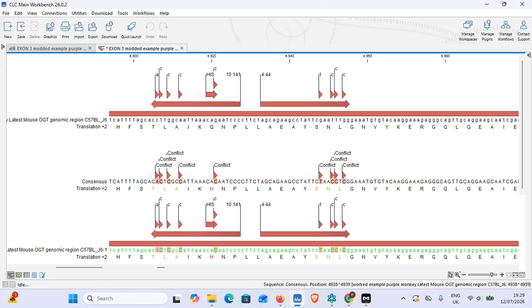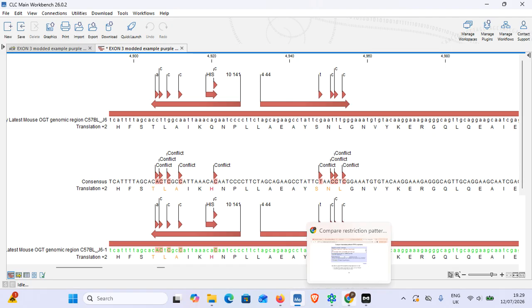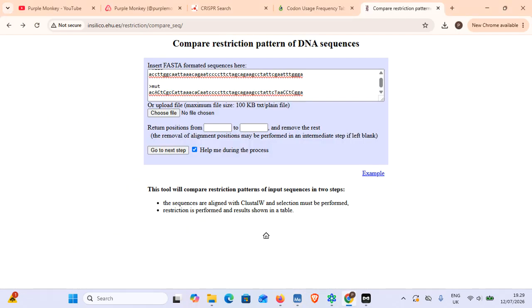But this is only part of the battle, and circling back to my video about flies, my first video, is, okay, now we have to work out how are we going to diagnose these guys, and what is the benefit, as well as changing the amino acid, of all this effort that I'm putting in. So, switching to this rather lovely website, I've included the link on my bio, so you can all do this yourself as well.